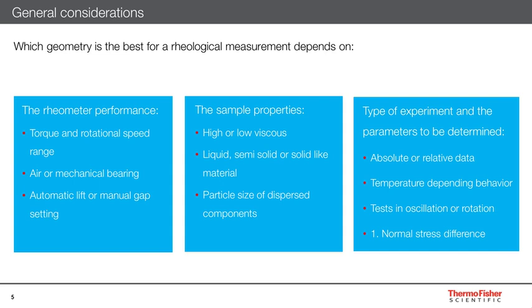The last factor is the test that is intended to be performed. Are you looking for absolute or relative data? Are you changing the temperature during the test? Do you want to perform tests in oscillation or in rotation mode? And do you want to apply axial forces during the measurement or even measure the first normal stress difference?